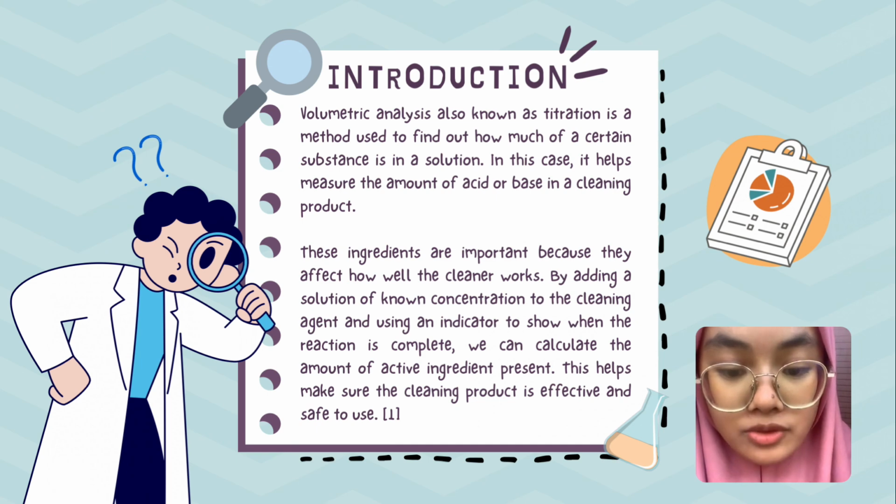This is important for several reasons. First, it ensures that the product is effective. If the concentration is too low, it may not clean properly. Second, it helps confirm that the product is safe. Too much acid or base can be harmful to skin, surface, or the environment.